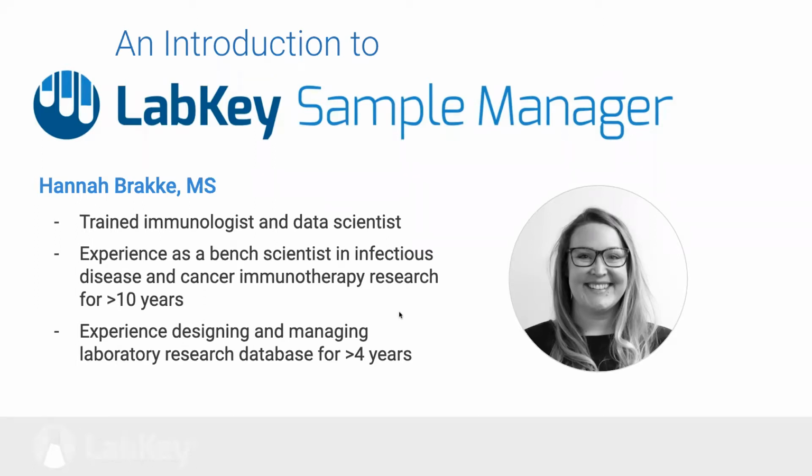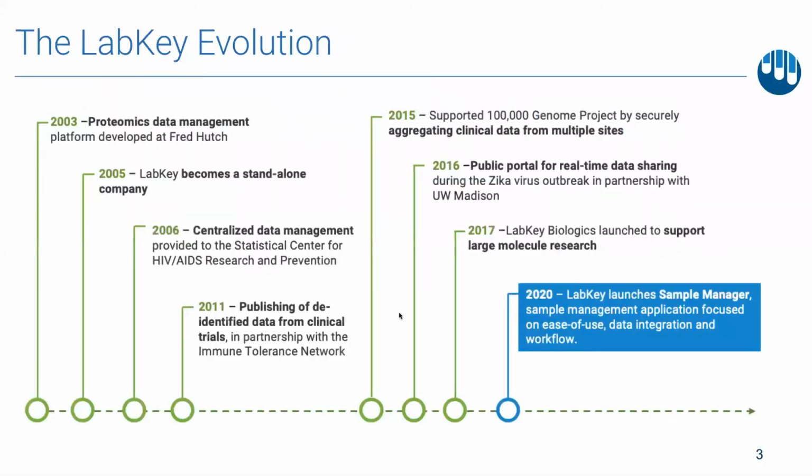I'm going to start with a little bit of background. As some of you may know, Labkey has been building software for scientific data management needs for over 15 years. We started out as a proteomics data management tool at the Fred Hutch in Seattle. After a couple of years, the founders of Labkey understood how important it would be to create a standalone platform that would continue to grow and be supported long-term.